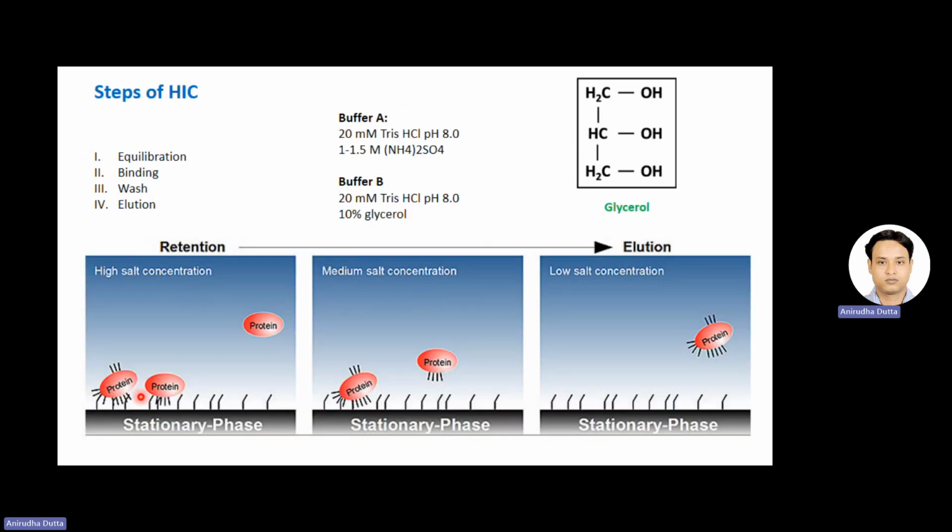For the protein with high or medium surface hydrophobicity, once you apply that protein, it will bind to the matrix, and then you have to elute it. So this mode of running a column is called binding and elution mode. That would be possible when your protein binds to the matrix.